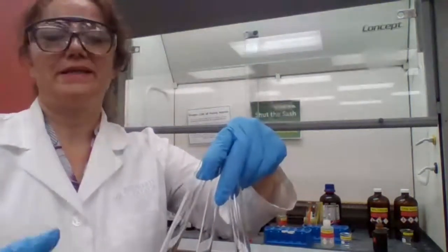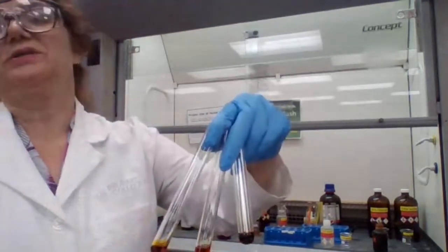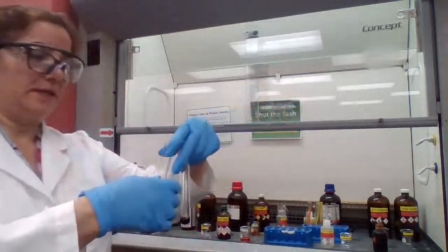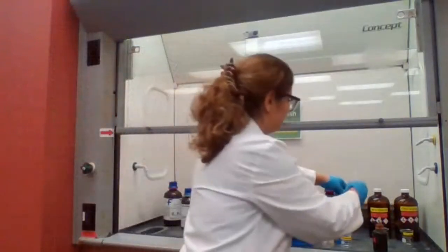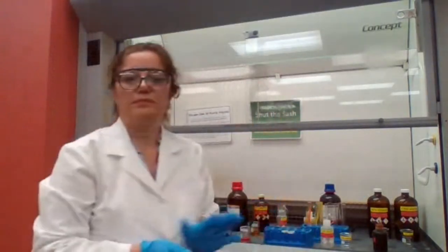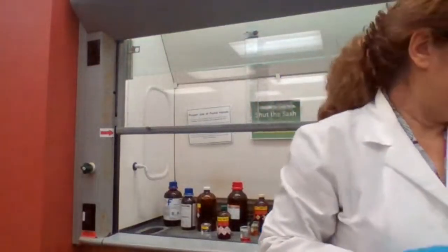Butyraldehyde is the only one that is positive because the color has changed. The ketones did not change color, stay the same color, and are not being oxidized. So, okay.